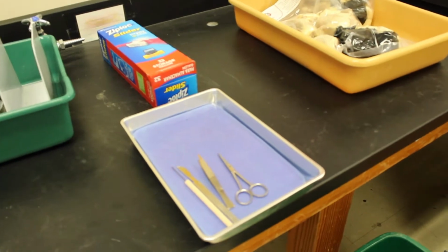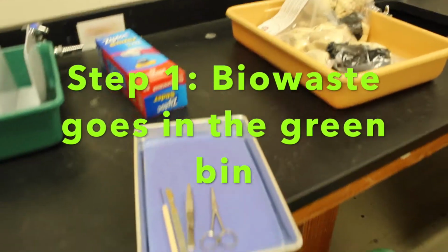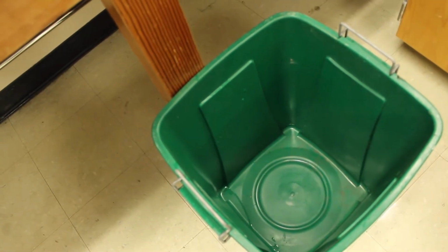Alright, so I'm going to walk you through cleanup. So, step 1, we have our materials, we have our pad. Any waste, so chicken leg, heart, whatever it is going to go in this green bin. Everything goes in the green bin, so all the pieces, all the chunks. That way we can dispose of it properly.